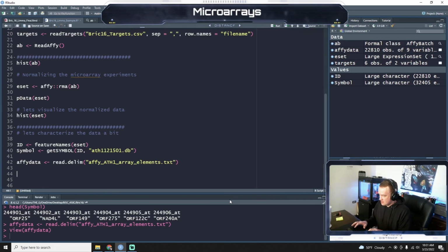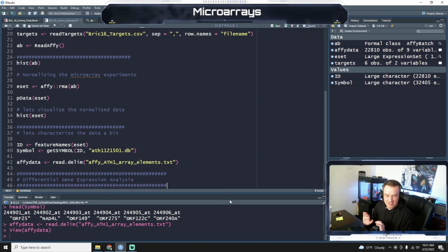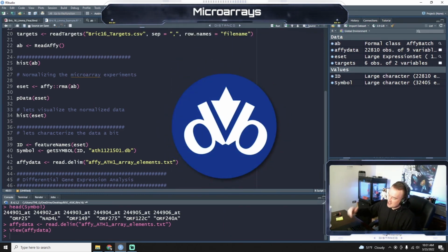The next section here is we're actually going to do differential gene expression analysis. But for the sake of brevity, and I know y'all like short videos, I'm going to keep it short here, and we'll break this down into another video. So we're off to a good start. We've got all of our data loaded in essentially. What we have left is to run the differential gene expression analysis and then make some biological sense of it in the end.